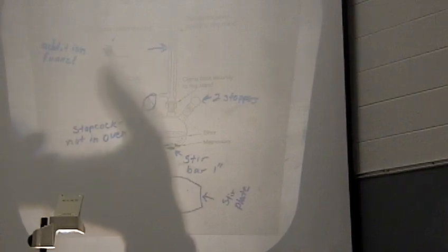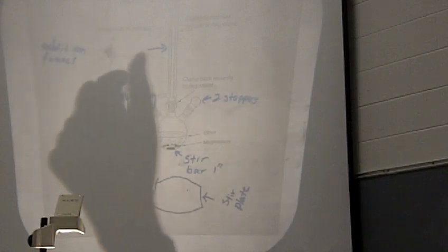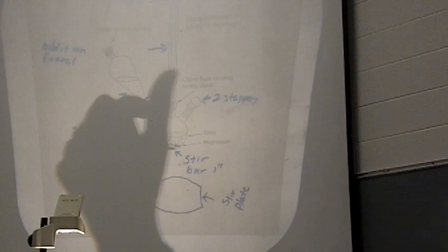In your lab manual, it tells you you're using 0.09 moles of aldehyde in 25 mLs of ether. Those solutions are already made up for you, okay? So you just have to find the bottle with the right aldehyde and get 25 milliliters of that solution. It is going to go in your separatory funnel as well, okay? So again, make sure the stopcock is closed. We're going to add our aldehyde solution here, okay?